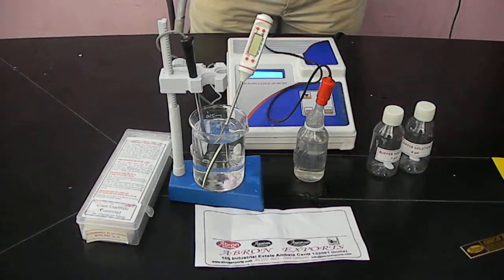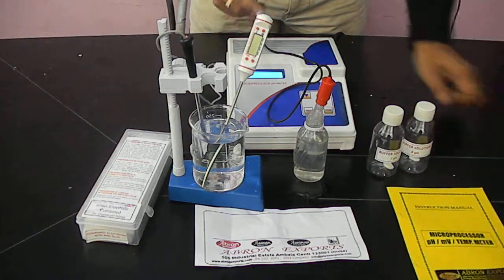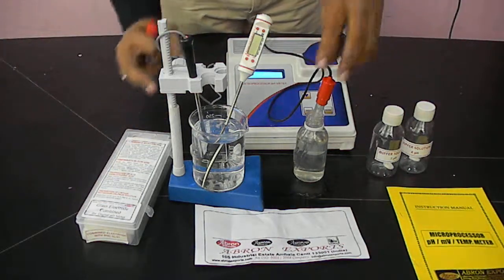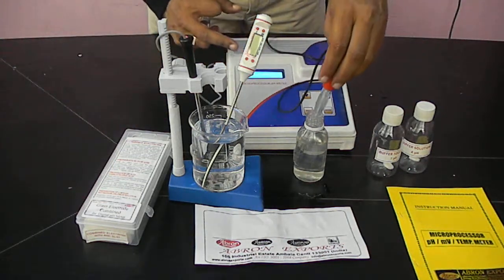This is a microprocessor-based pH meter by Abron Export. It has automatic temperature and buffer recognition also. This is a combined electrode we have provided. This tip is a semi-permeable membrane.